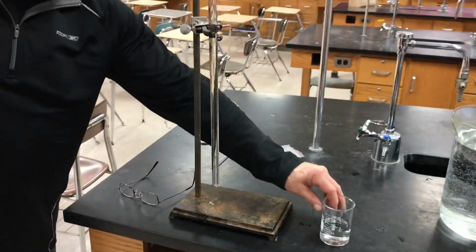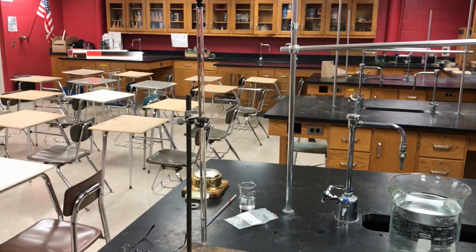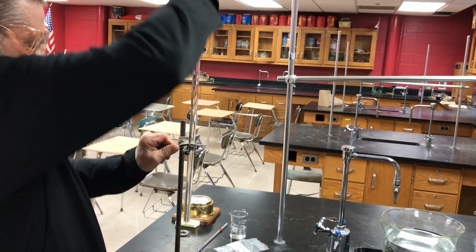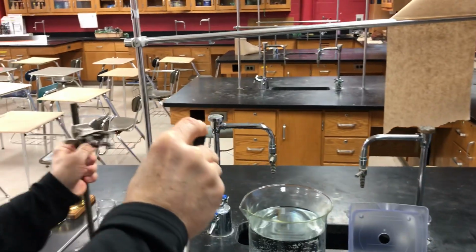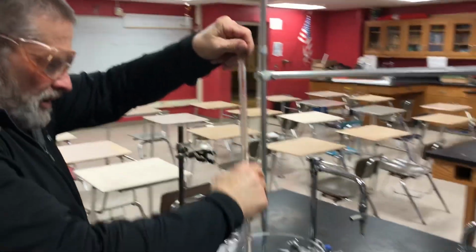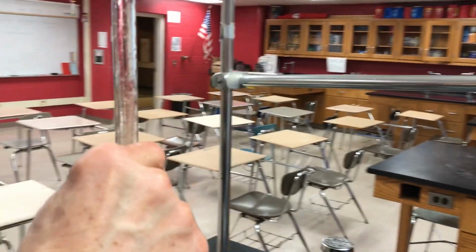And you'll really be able to see it when Mr. Havel inverts the tube, turns it upside down, and the more dense HCl is going to work its way down the tube. Are we ready for that? Okay, yeah. So here we go. The stopper at the top does have a hole in it, so he's going to have to plug it with his finger. He's doing that right now. Okay, so we're going to invert it into this beaker of water. Looks like I got one little air bubble in there. Well, we're going to pretend that didn't happen. That's right. And take a look inside of there.